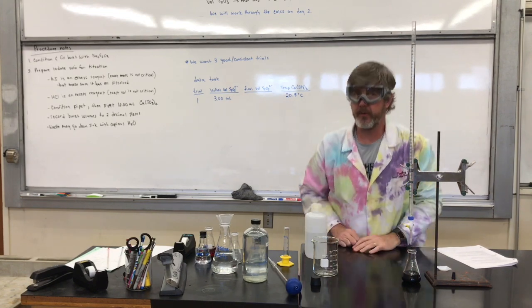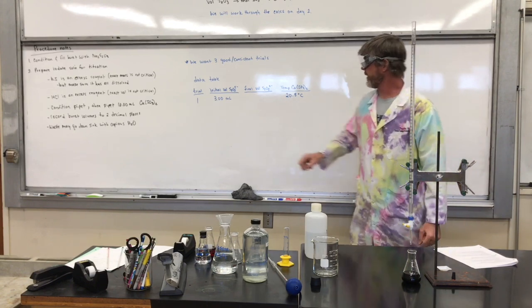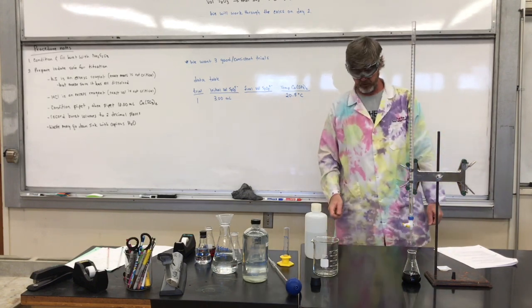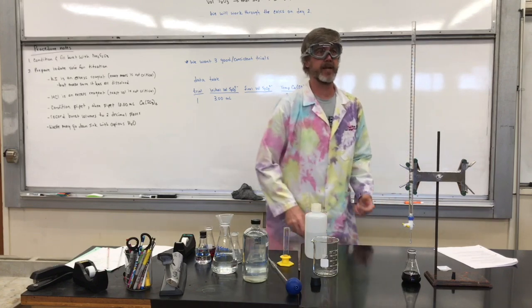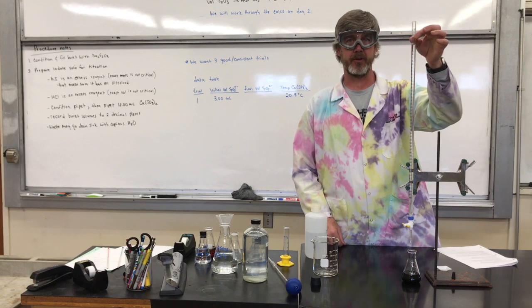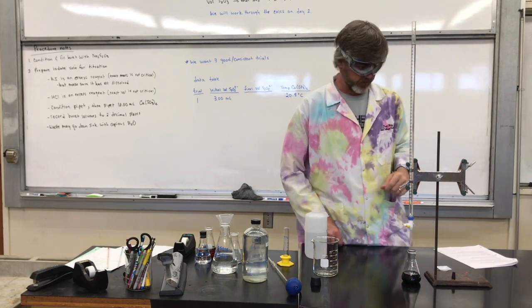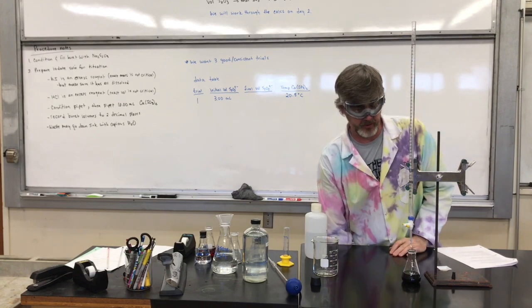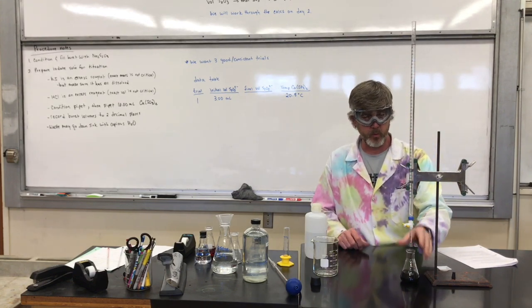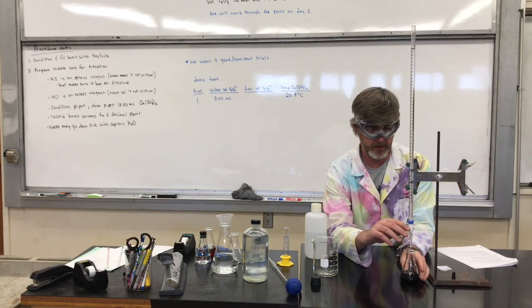Now I've recorded the temperature of our calcium iodate. We're at 20.8 degrees today. My initial volume of thiosulfate happened to be right at 3.00. Again, we don't want to set it to a specific number. I just drained a little bit through my tip, and that's what I saw for this particular titration. And what we're going to do now is titrate until the solution turns clear.